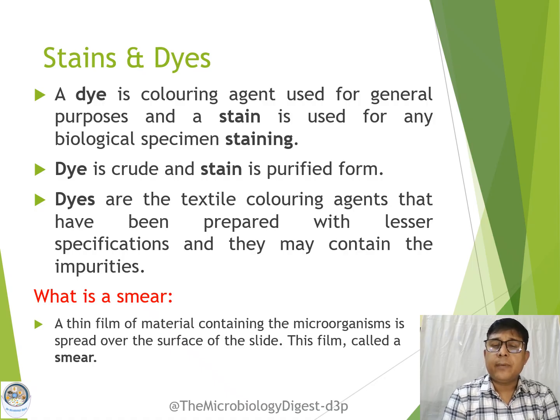Now, two terms are very confusing. One is stain, another one is dye. Both are almost similar, but stain is a coloring agent used for biological specimen staining. We use the term stain for biological staining, and dye is used for any general purpose of imparting color.